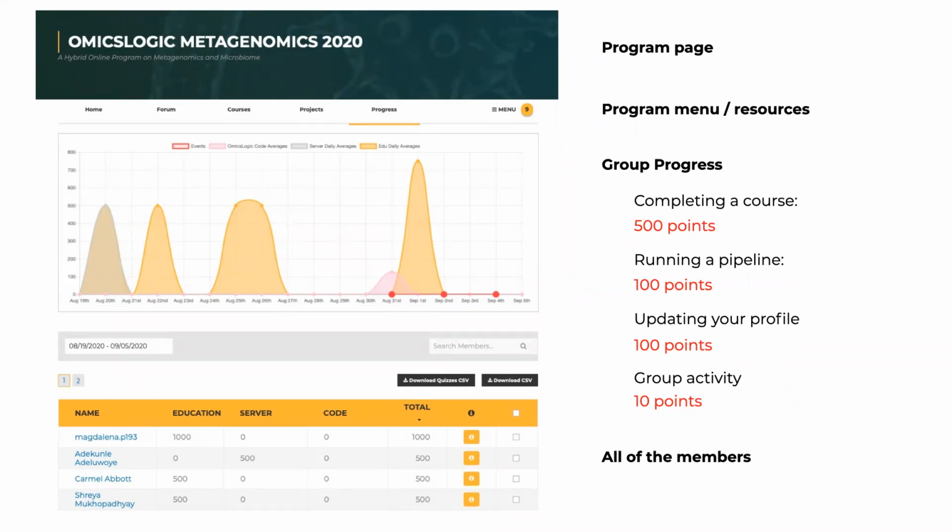That demo pipeline quickly produces outputs because it's already run, but it's also kind of demo data. So to really understand how to run those data sets, I hope that you had a chance to go through the tutorial in Metagenomics 1, because if you want to analyze data sets that you have found on NCBI, today I will show you how to actually download the data from NCBI and prepare that pipeline. You have to understand how all the settings come together, and so it's useful to do that tutorial in Metagenomics 1.